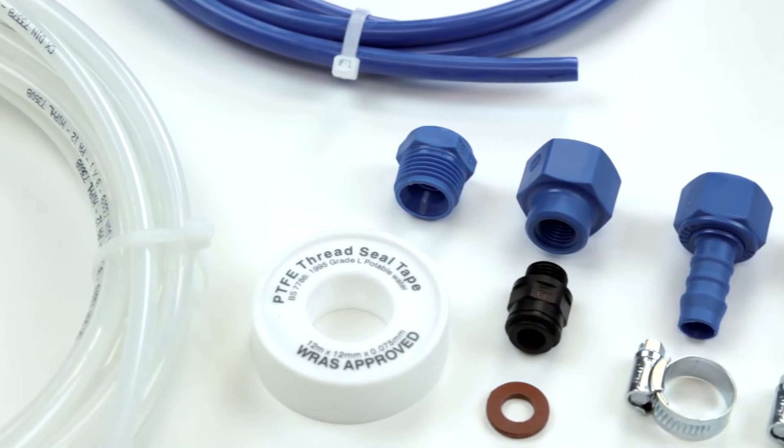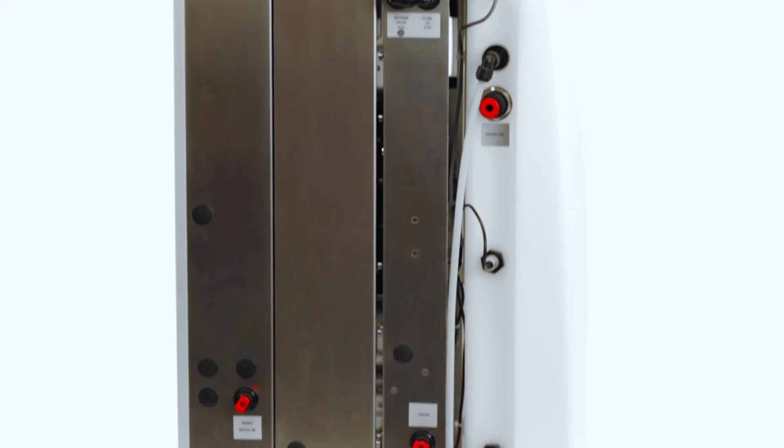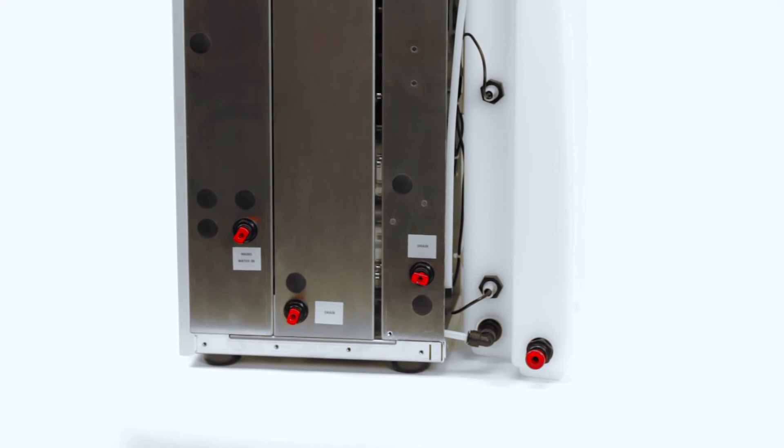However, for wall mounting the unit, an additional wall mount kit should be purchased. All feed water, drain and overflow connections are on the rear of the unit.